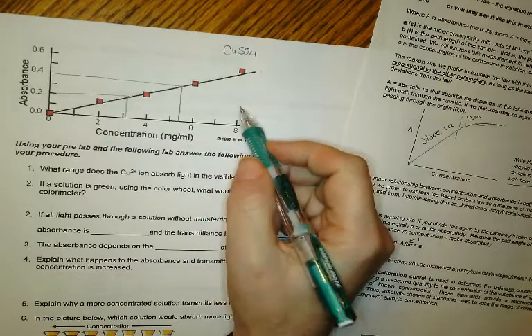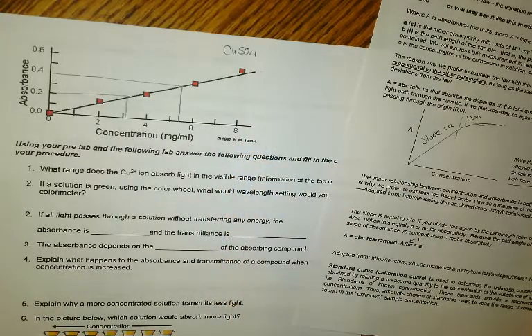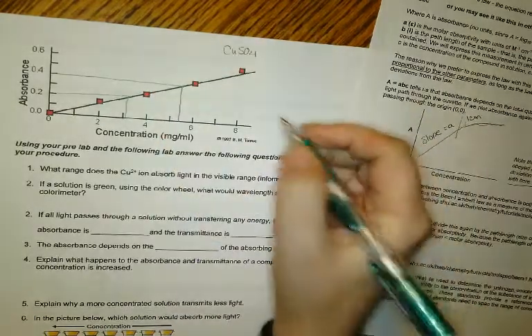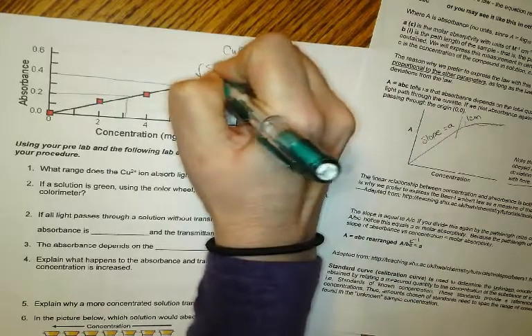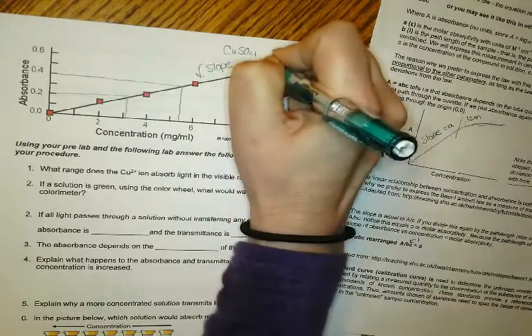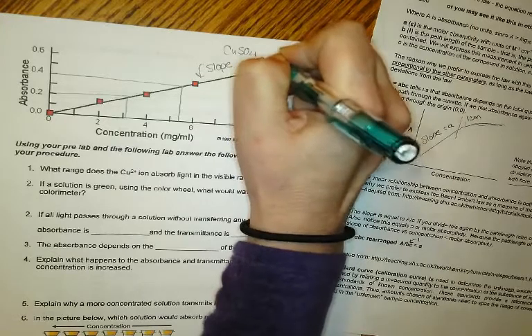And that's what our standard curves do. And again, this is a lab technique we do not just with Beer's law, but with some other things, okay? And now this slope is going to equal the molar absorptivity, okay?